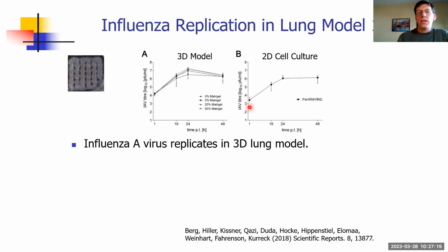And here you see the results from a 2D cell culture. And in our 3D models, the virus also replicated nicely. And at least to our research of the literature, that was the first experiment carried out to do infection studies in a bioprinted organ model.